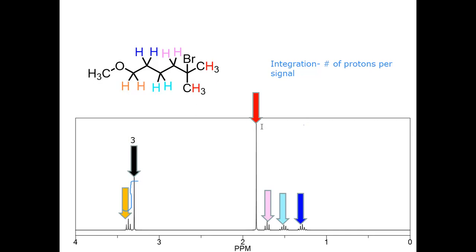All right. So question. Go ahead. So we don't count the other hydrogens? Which other ones? Because I'm seeing the different colors, like the pink. Everything is separate. That's a great question. Everything is separate. So let's look at the red signal. Let me see if this is going to make it click for you. You have 3 here and 3 here. Is that right? And they're all equivalent. So what's the total? How many protons should that signal represent? Yep, these 3 and these 3 are equivalent, and they're all represented by the same signal.